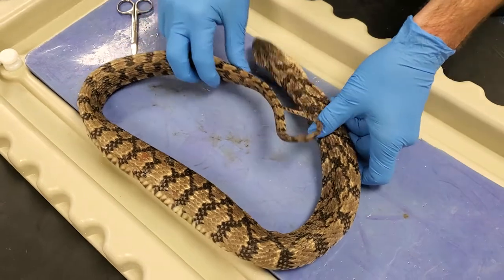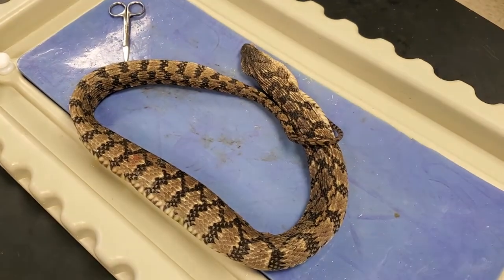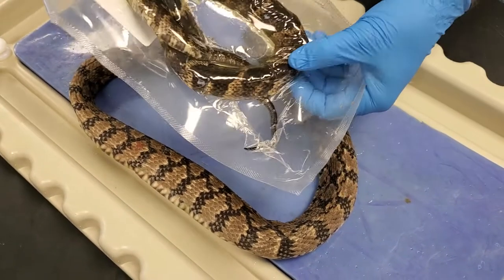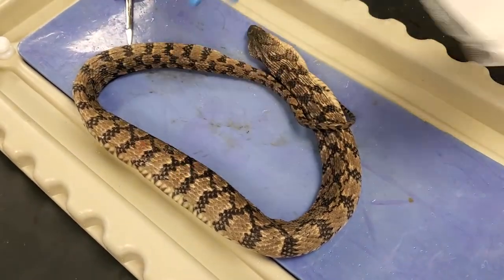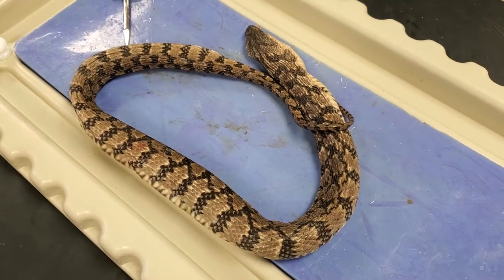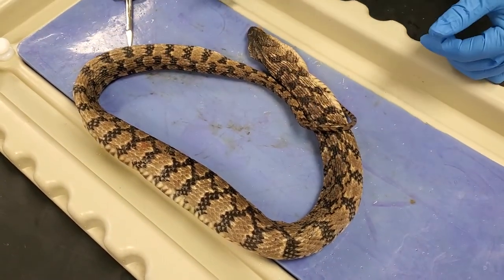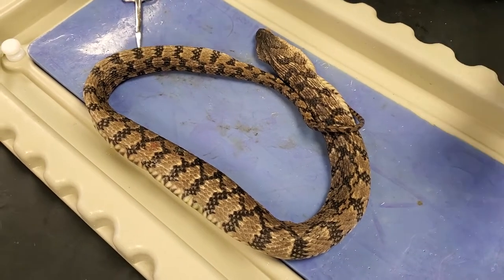So here's the snake here and this is kind of one of the larger ones. Here is a smaller one we just bagged up here. This is definitely going to be a male. This one is big enough to where it might end up being a female, but we're not going to know for sure until we get her open and get the gonads out — the testes versus the ovaries do look differently.